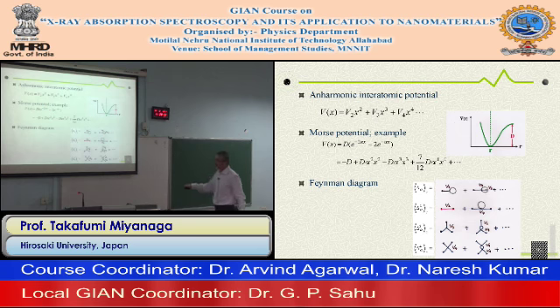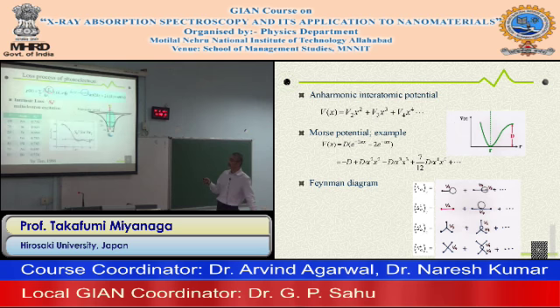The connection between the cumulant order and the coefficient order of the potential becomes simple. Realistic actual calculations include more complicated systems, but the result after some approximations is very simple.